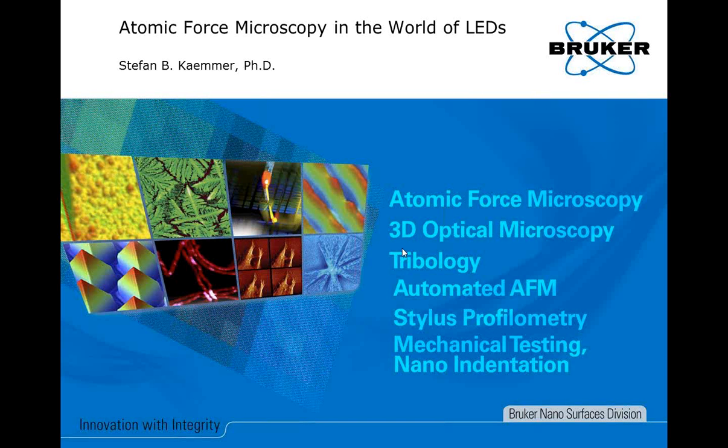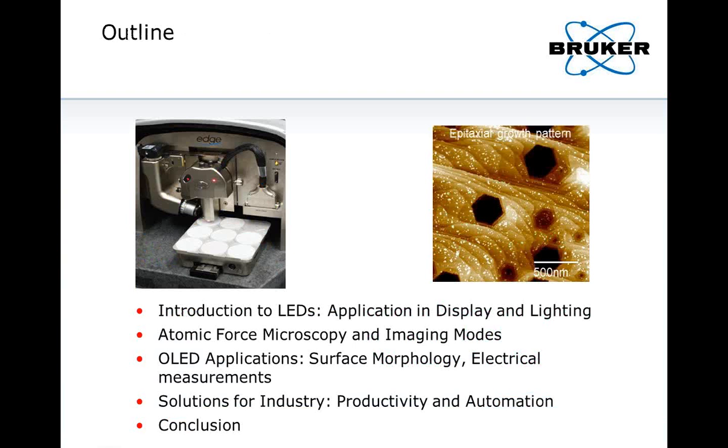outlined the webinar as follows. We will start with an introduction to LEDs, talk about applications in display and lighting, and then just to get our participants from the LED side up to speed, we will introduce just very briefly atomic force microscopy and imaging modes. We will then go ahead and talk about OLED applications, surface morphology and electrical measurements, and then just before the conclusions, talk about solutions for industrial environment, highlighting productivity and automation.